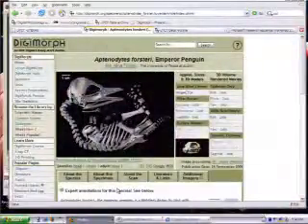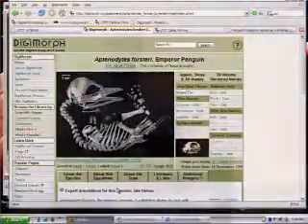This has been our primary output format for the last 6 years. It's great. It's very popular. It's won Scientific American awards. It was one of Yahoo's top 25 science sites a couple years ago. We get a lot of interest from educational audiences, a lot of outreach purposes, but it's a little bit, maybe a lot, low on resolution for scientific applications.